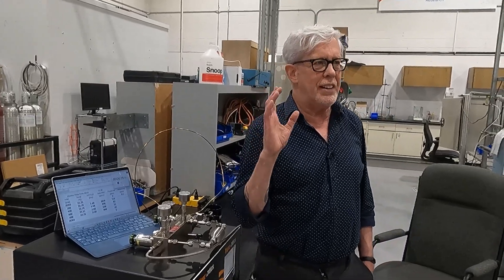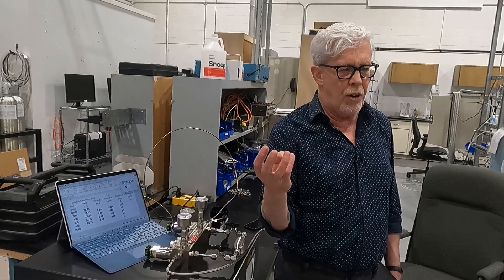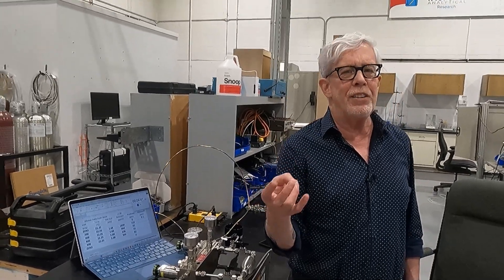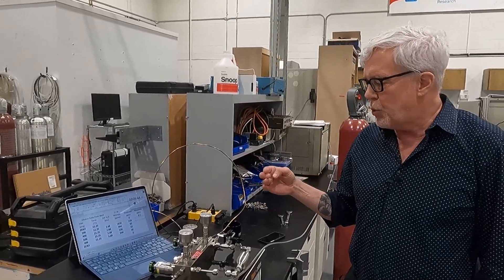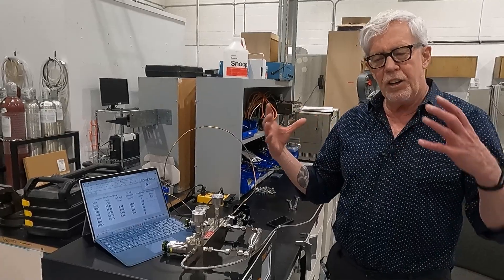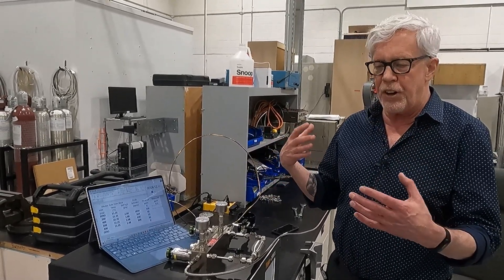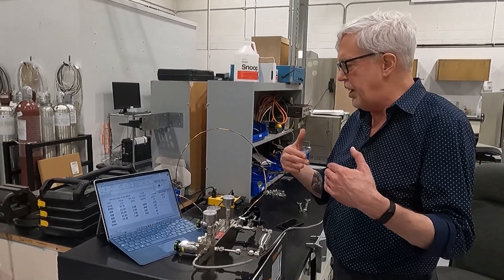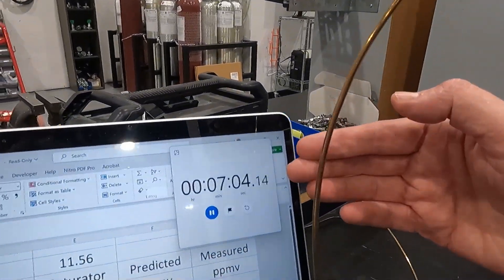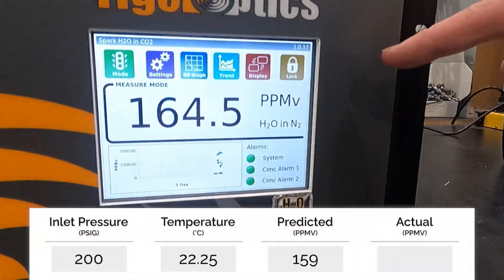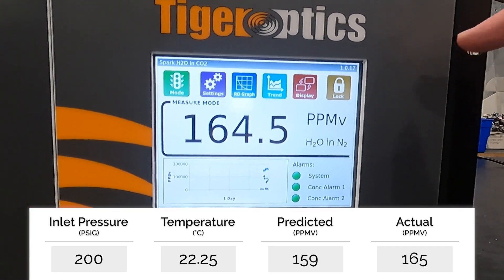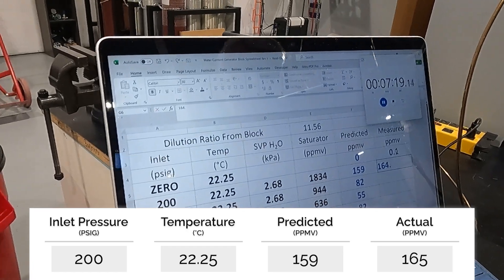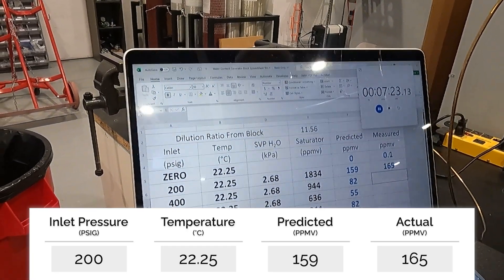One of the things we'd like to get from a moisture generator is the ability to generate a known concentration with fast enough response time that we're not waiting long for equilibrium. We've done several things in how we've designed and encoded materials inside the block to ensure fairly fast response and minimize adsorption and desorption effects. We've just hit the seven minute mark. Looking at the analyzer, we've stabilized at 164.5 ppm — we'll call that our stabilized value. The spreadsheet is set up to not show decimal places, so it'll call it 165.